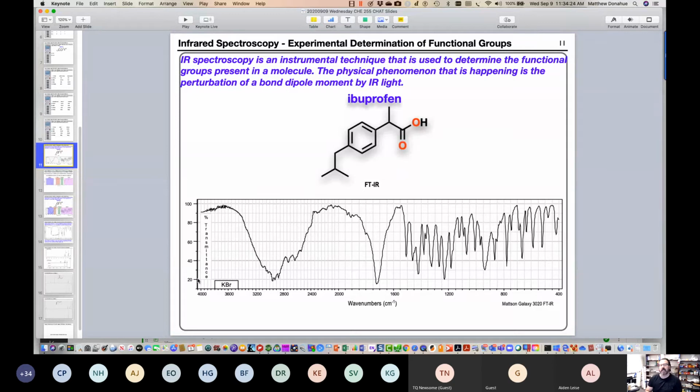So what does that mean? That means that one of the functional groups present in that molecule is absorbing that light. If you look at the range from 4,000 to 400, that span of 3,600 wave numbers, across that span, where you see these peaks, where something is absorbed, I know that sounds weird because it's going down, we're calling it a peak, a signal, whatever. Where it occurs is indicative of what type of functional group is present.